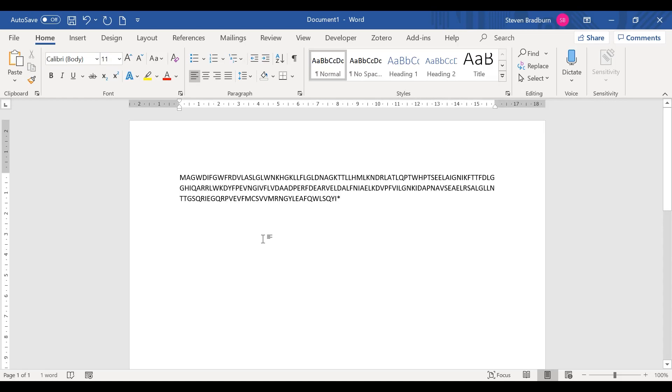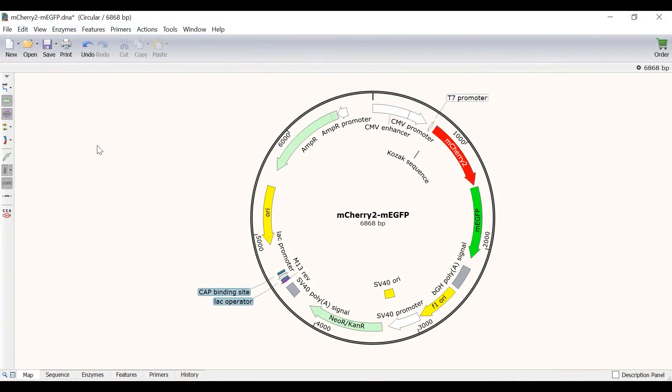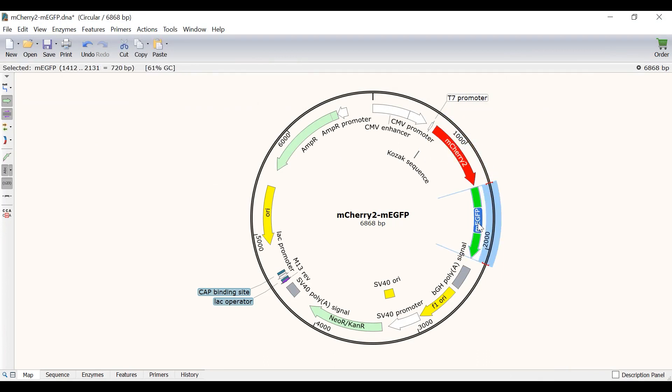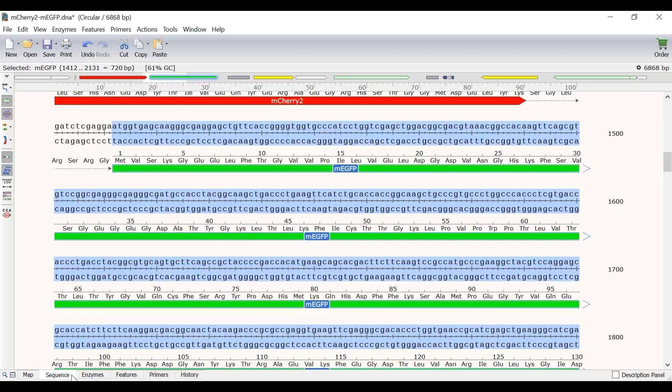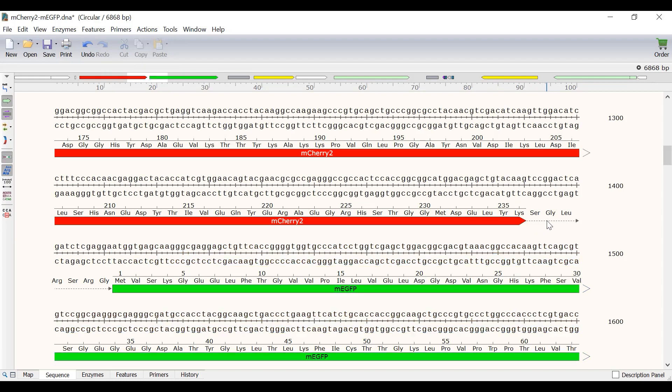For this next part of the tutorial, I will open a file that contains a plasmid with the mCherry2 sequence that is fused in frame with monomeric EGFP. If I switch to sequence view, I can see the mCherry2 feature lacks a stop codon. I know the two sequences are in frame because the extended translation from the upstream feature mCherry2 is on the same line as the translation of the downstream feature monomeric EGFP. The two features are also connected with a dotted line with an arrow.